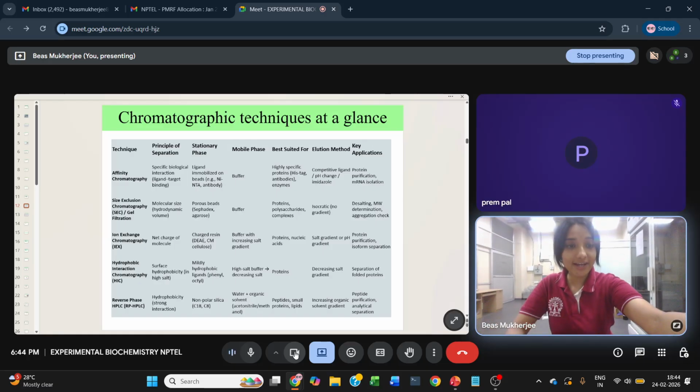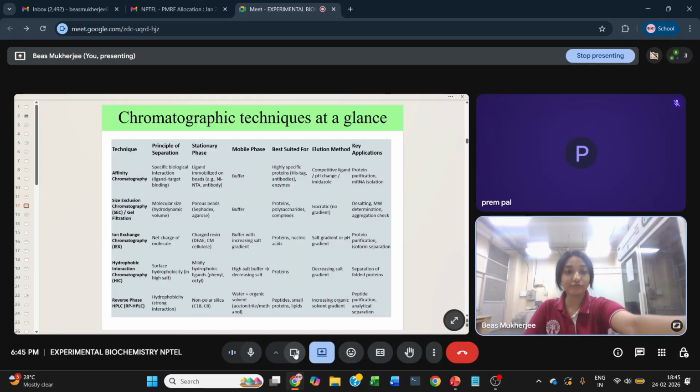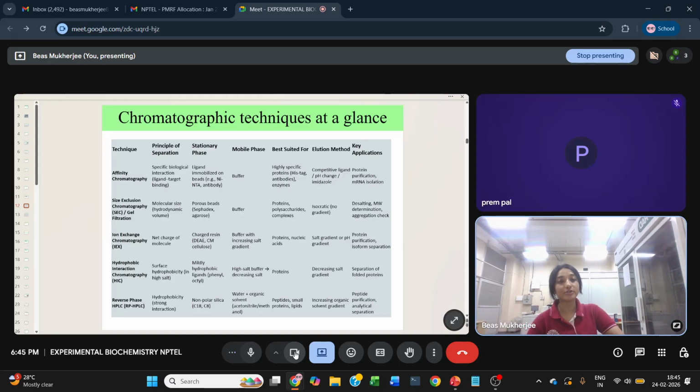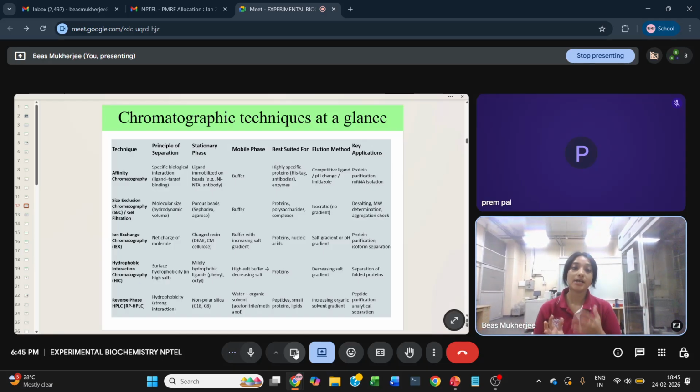Hello everyone, welcome back. So here we will not have this issue with lights, hopefully. Right, so let's continue. We were talking about the different kinds of chromatographic methods, and the last one that we have is reverse phase HPLC. So this is again utilizing the polar nature of the solvents. So what is normal phase, what is reverse phase? We will talk about all of this in detail.